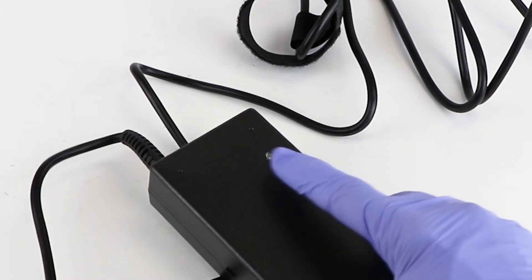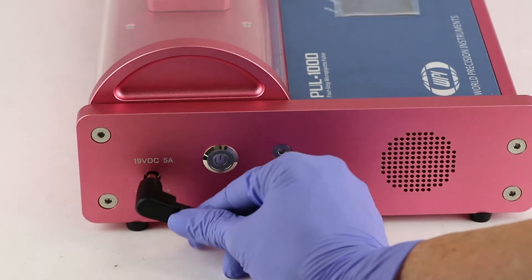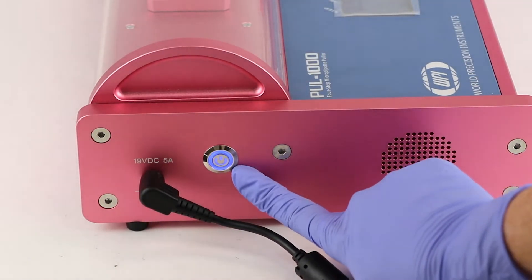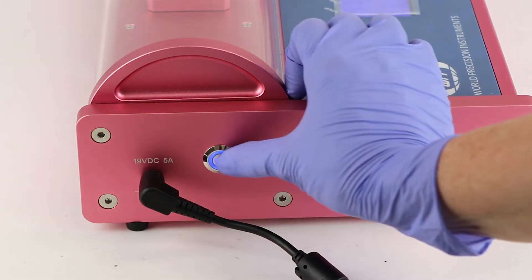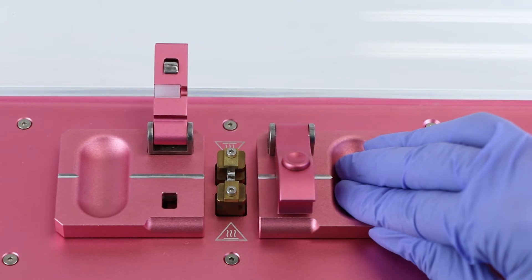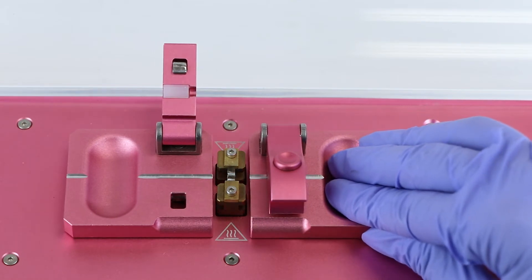Now plug the power cord into the POOL 1000. The switch illuminates. Press the power button on the rear panel to turn on the display. Push the carriages together toward the center to open the clamps.